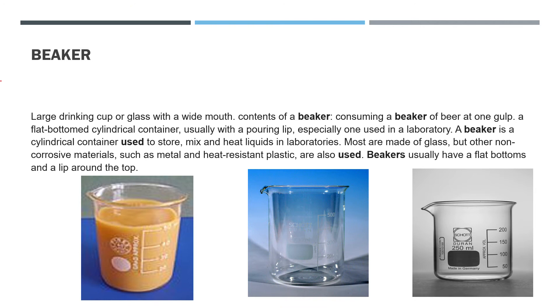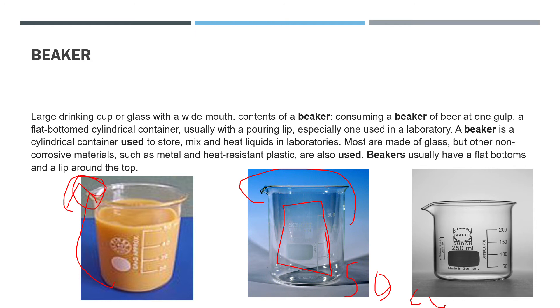A beaker is like a large drinking cup. You can see it has a small lip which helps pour out liquids. It is used in chemical labs to store liquids, and it is measured in 50 cc and 100 cc.